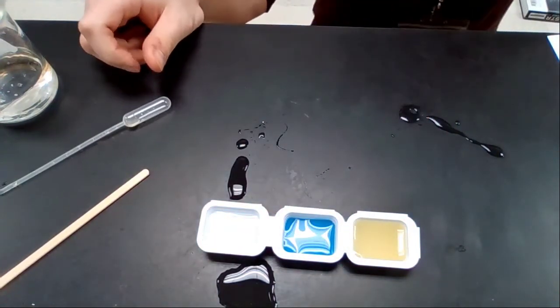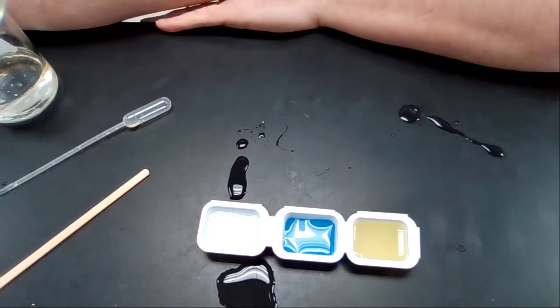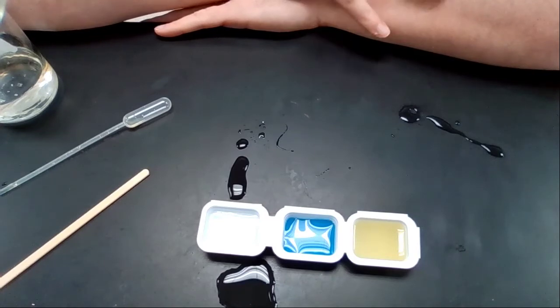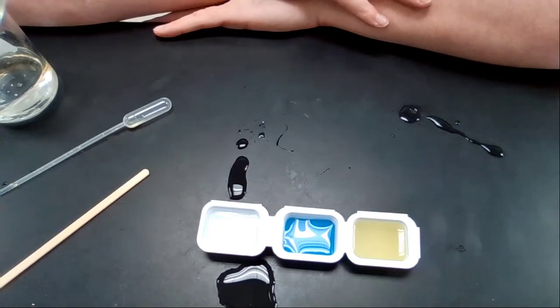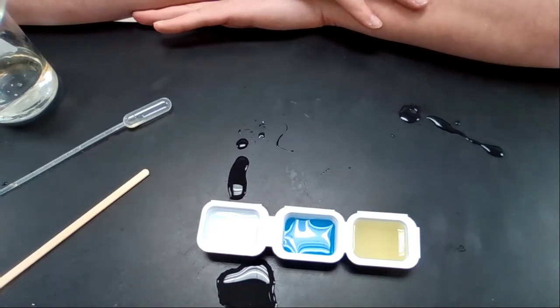So again, just think about what's happening here in terms of an acid and base reaction. That's what I really want you to think about and focus on. Remember what is happening when we're adding the acetic acid to the magnesium hydroxide. How does that shift equilibrium? And then also think about the change and what causes the change in color. Remember, we're using a pH indicator that changes color based on the pH of the solution. So just a couple things to think about.